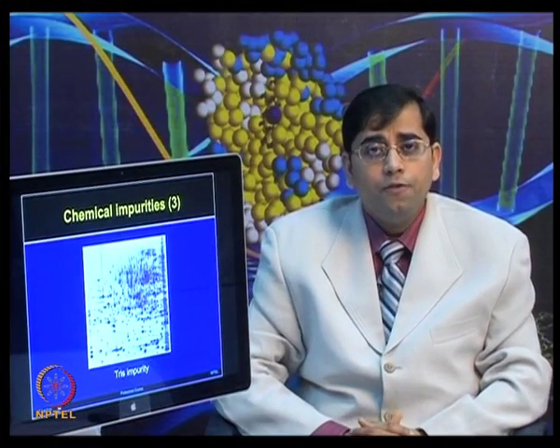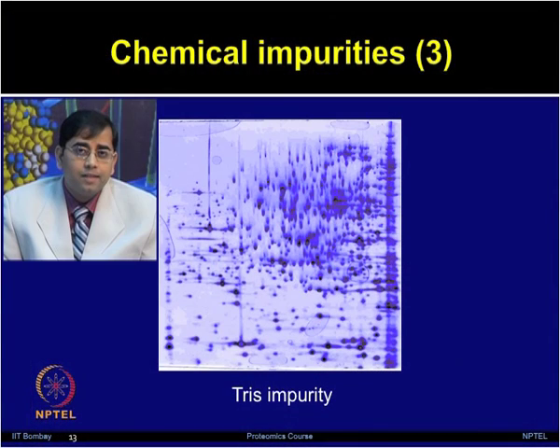Now, if your chemical such as Tris is not of very good quality, it is impure, again that will show some artifacts in the gel.